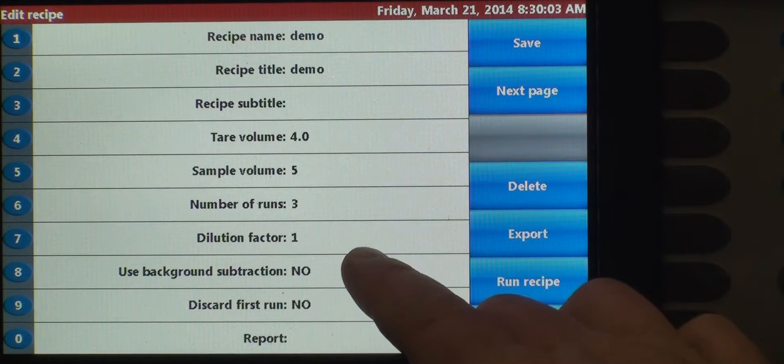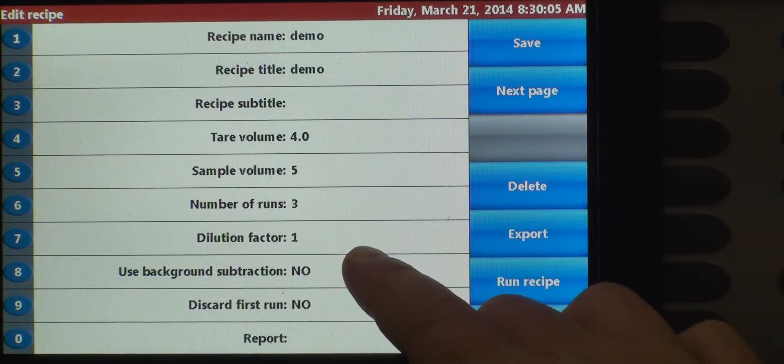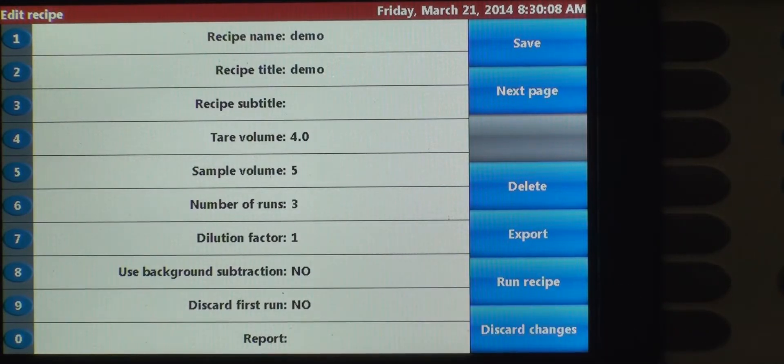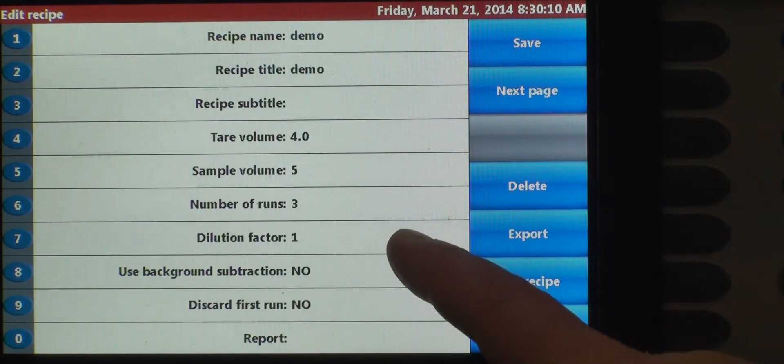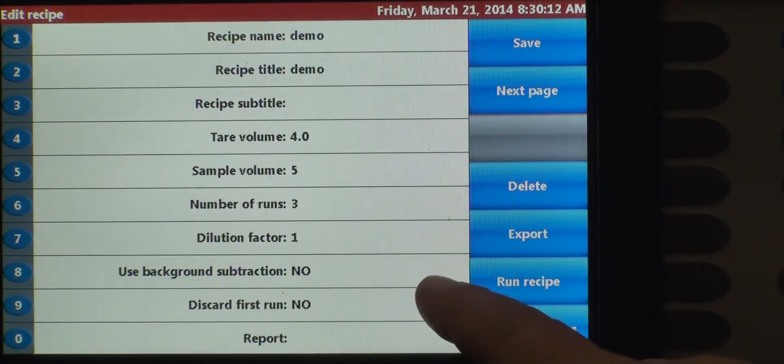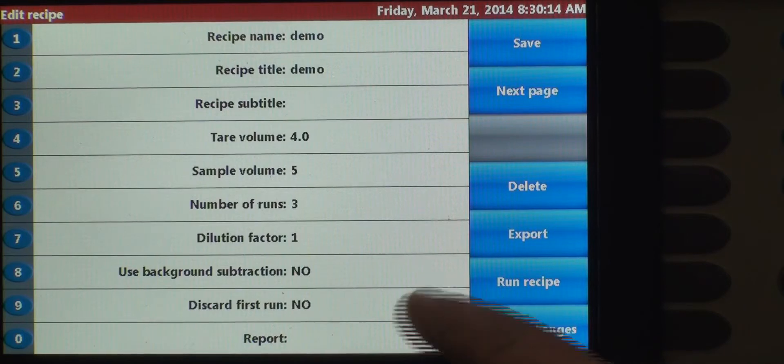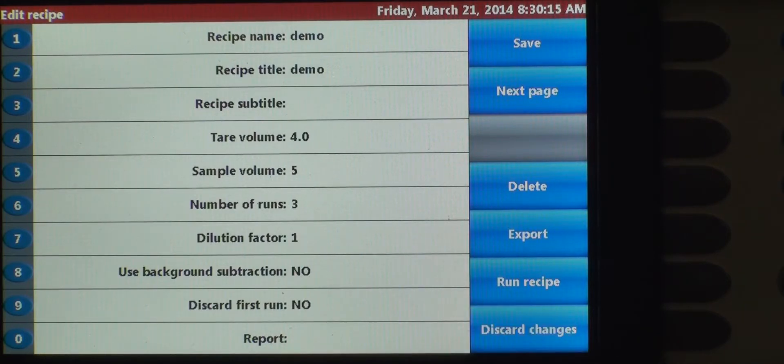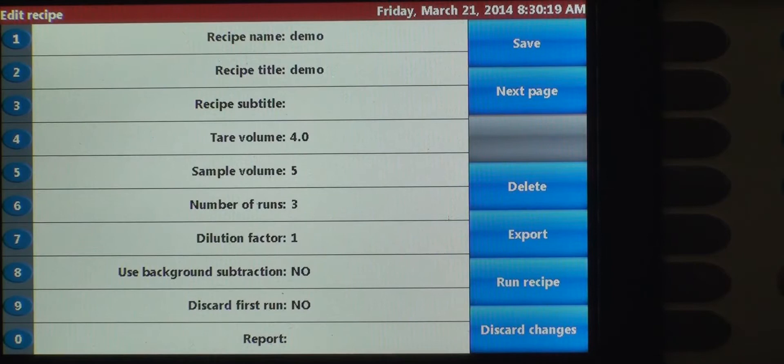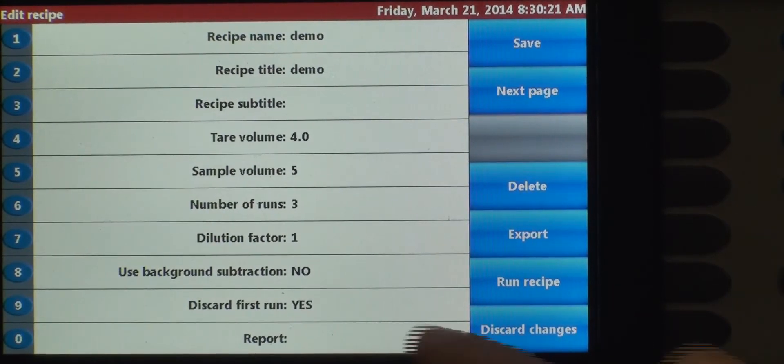We're not going to dilute it, but the dilution factor is built in and will run the math for you. So if you want to dilute your sample, say two to one, you can change it right here. We do have an option for background subtraction as well, which we're not going to use for this particular sample. We are going to discard the first run.